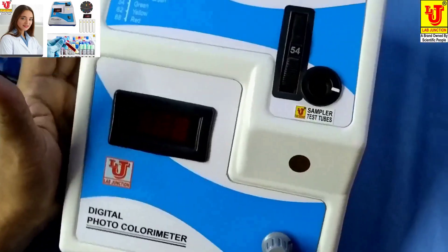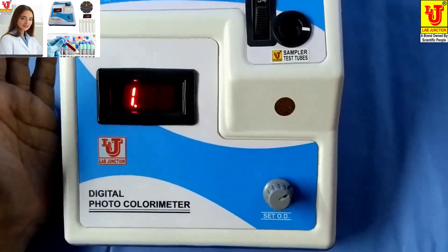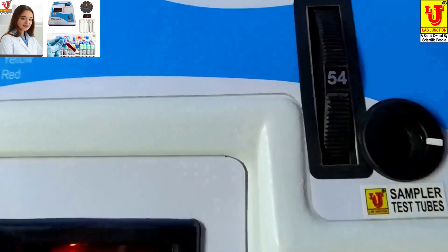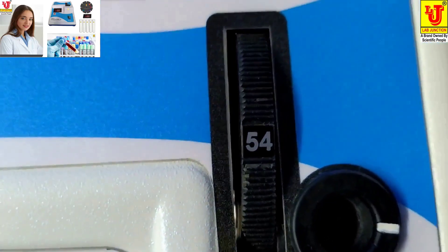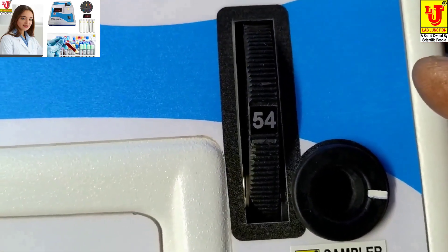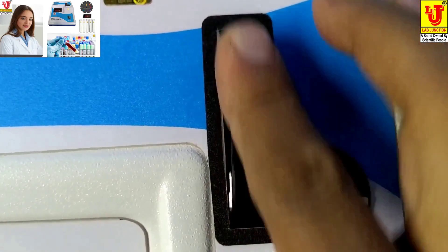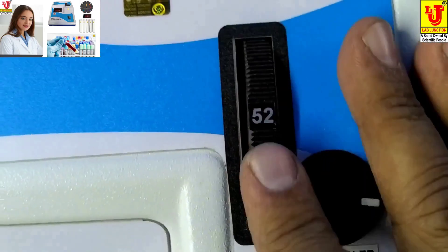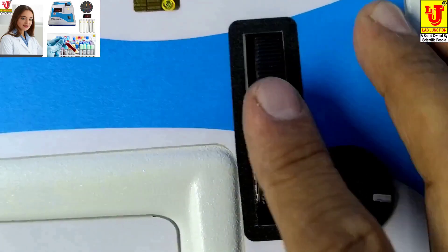Switch on the instrument and set your wavelength for your test. For example, glucose is done on 540nm. You set your wavelength from the filter disk like this.